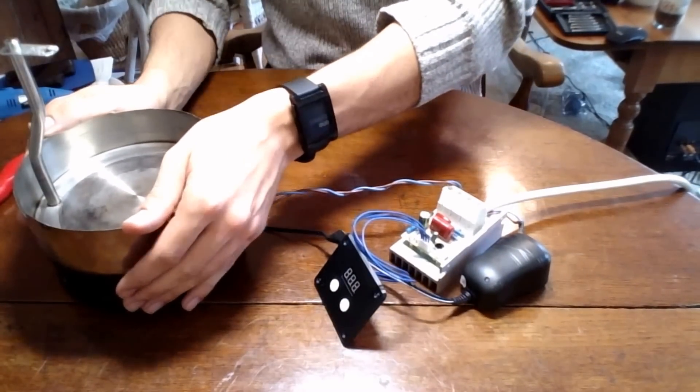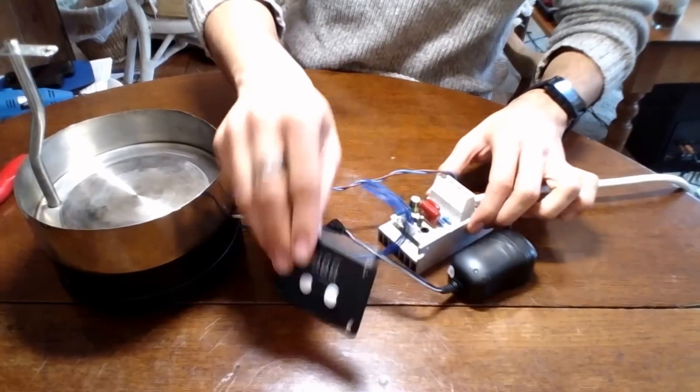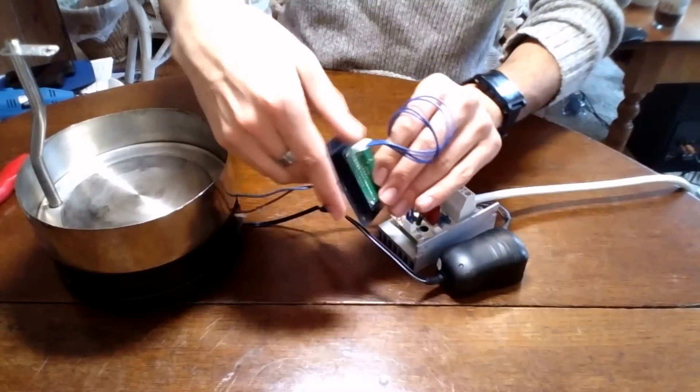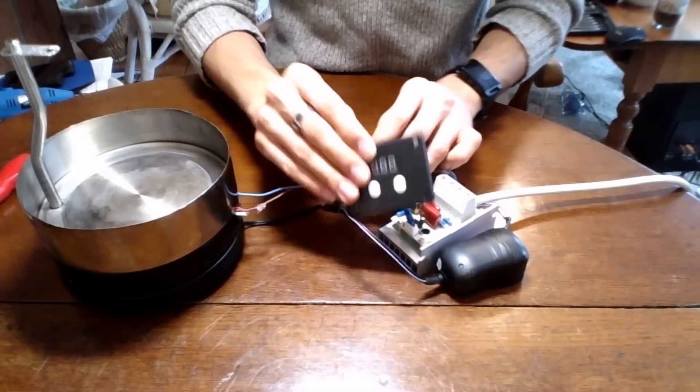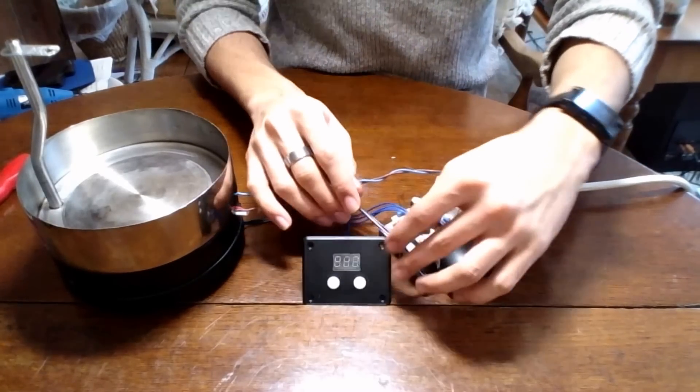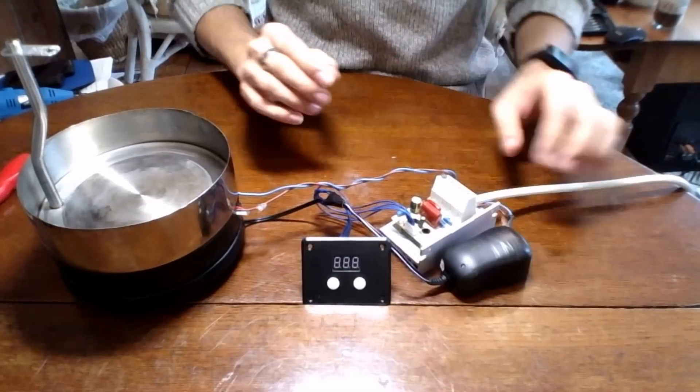Now for the variable control, what I've done is I have this digital voltage controller, and that's just for the heating element, and that's just to control the power going to that and how hot that gets.